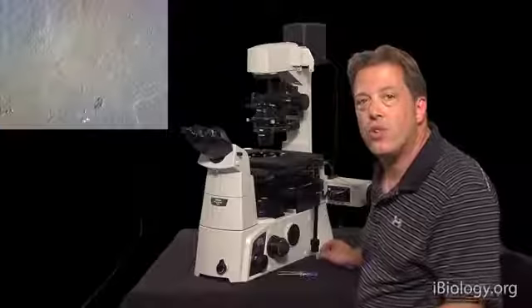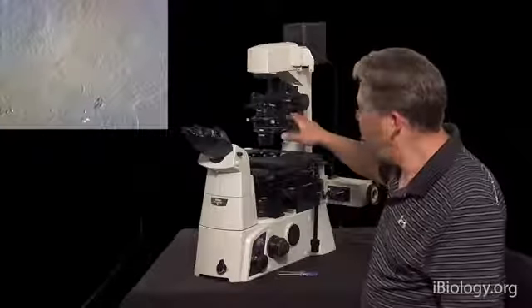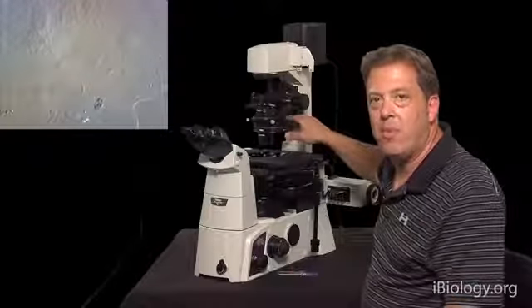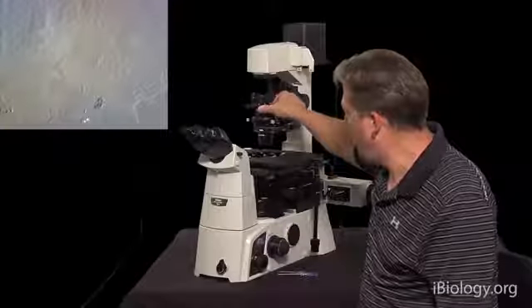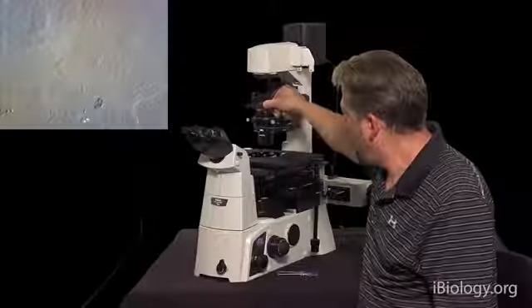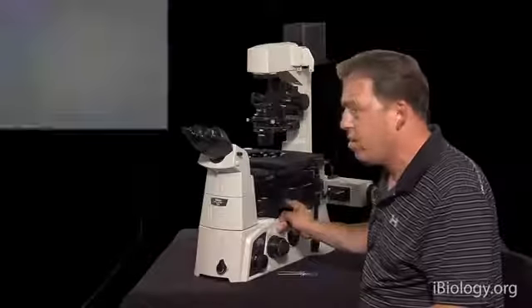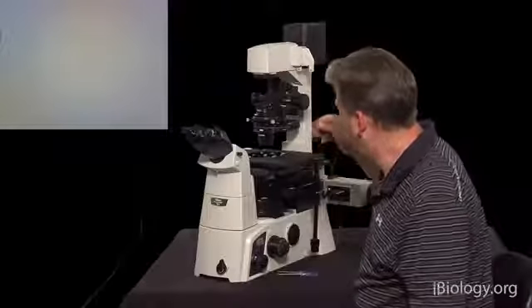So now we're going to switch to phase contrast on the microscope, and this is because this is a universal condensing system, we're able to do that with the same components without switching out the condenser. What we'll want to do is pull out our polarizer and remove our analyzer, and now I want to go through phase contrast and how to adjust it.